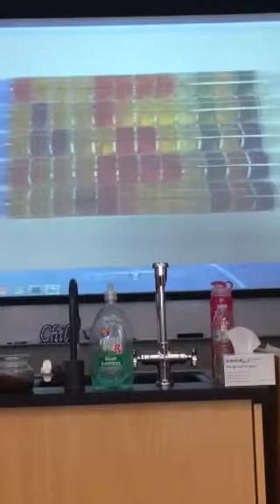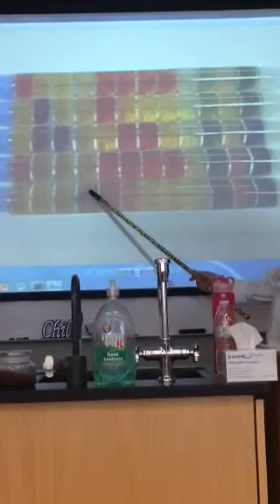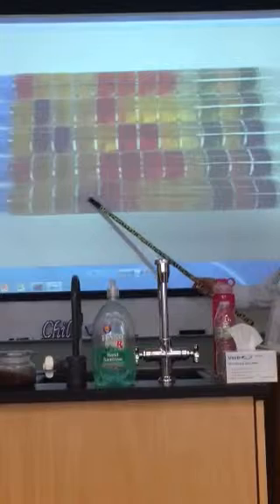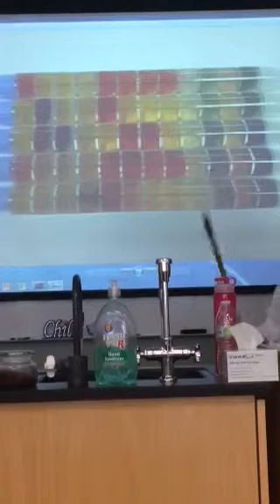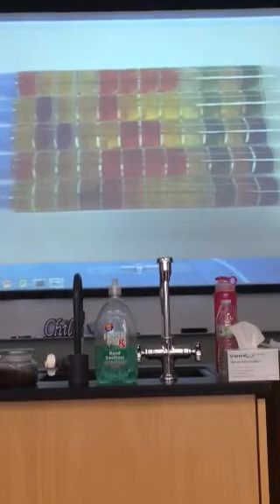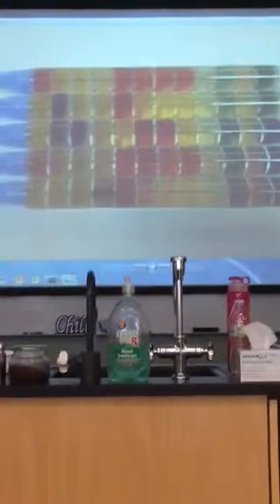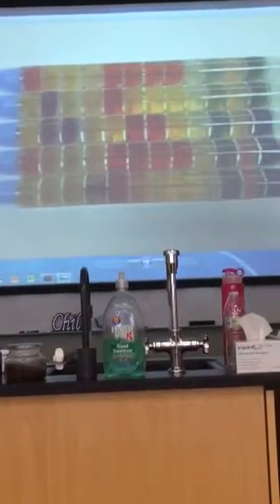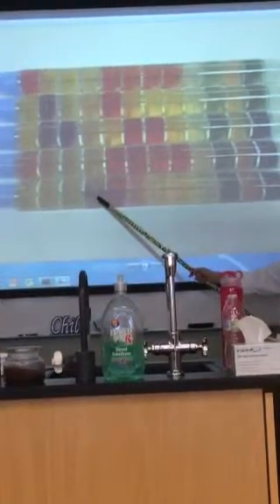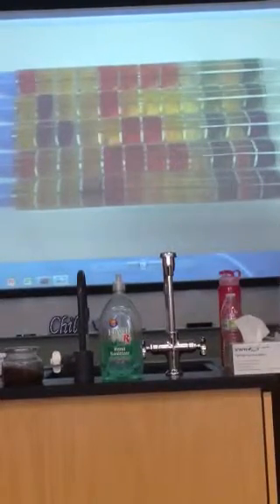Now let's look at how we differentiate Enterobacteriaceae from one another. Here's Citrobacter. Citrobacter and Salmonella are the only two, and Shigella, maybe, I'd have to check the Shigella, that give you that black H2S precipitate. It should also have done that on the SS agar. Your Citrobacter didn't do it on the SS agar, but it should have. The agar's just not sensitive enough. But the Salmonella did. So this Citrobacter, that's the same thing as SS agar. You get the black precipitate. E. coli doesn't make it, neither does Serratia.